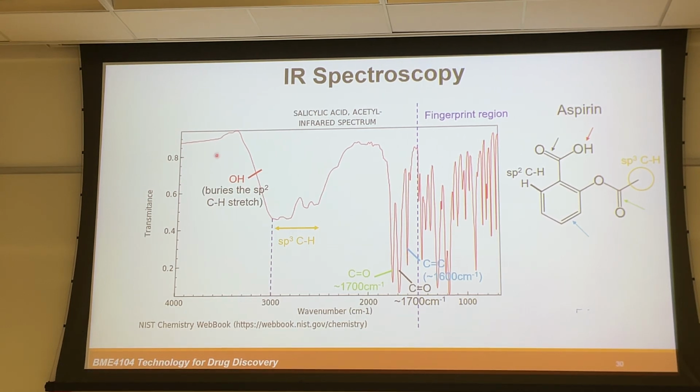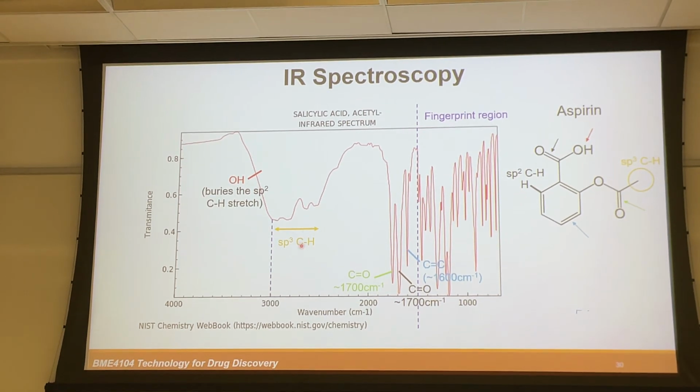And this spectrum that I'm showing you as an example here is actually a spectrum for aspirin. And aspirin has a molecular structure like this, and I'm indicating those functional groups with different colors, and you can look back after class to see whether they match what we have learned earlier, and you can try to imagine how you interpret this structure. If you don't know it is aspirin, right? You can try to see whether you yourself can tell they have those types of functional groups just simply from this spectrum. Okay, so it can be an exercise.